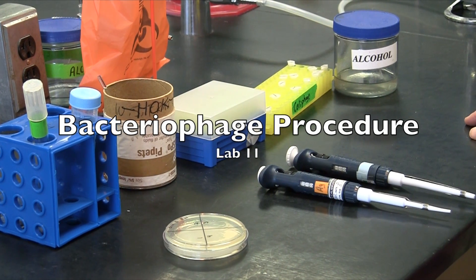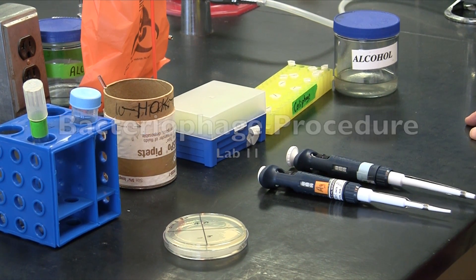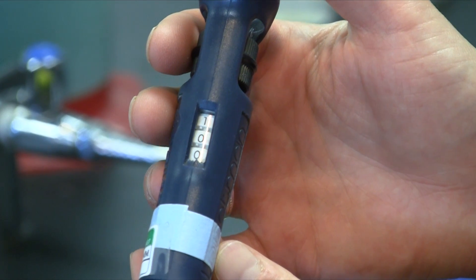In this procedure, we'll be isolating bacteriophage, which are viruses that attack bacteria.